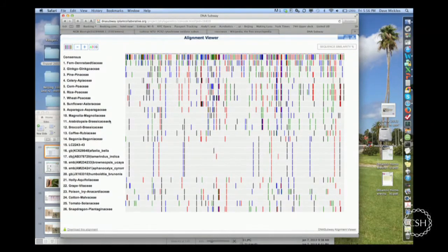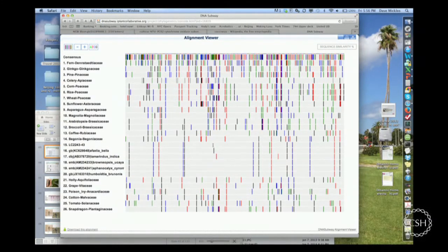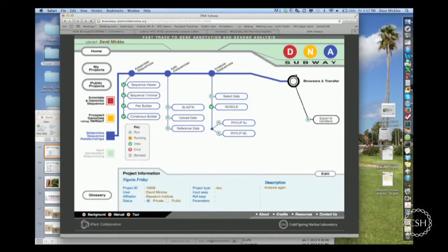Now we have pretty pure barcodes here. Again, here's our group shaking out. Here's the polymorphism difference between my sample and the GenBank record. Let's build a tree. Now, I'm not an expert at trees, so if you ask me a lot of questions about it, I'm sure to give you the wrong answer.